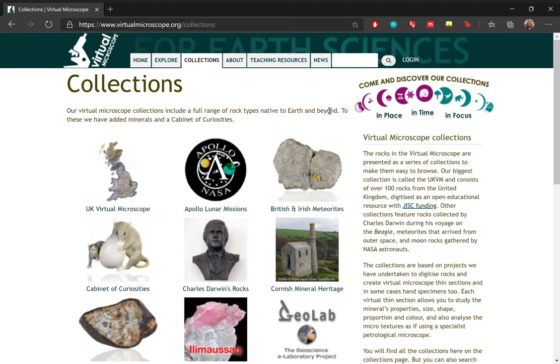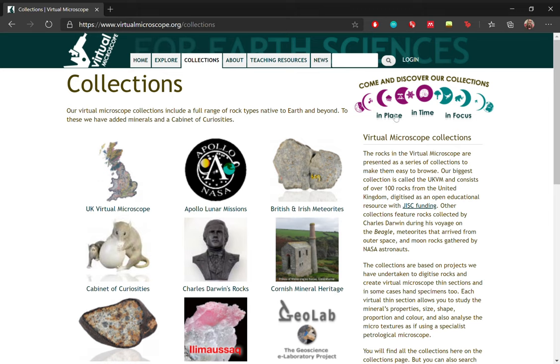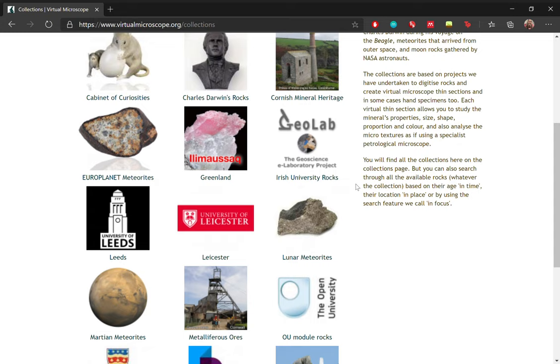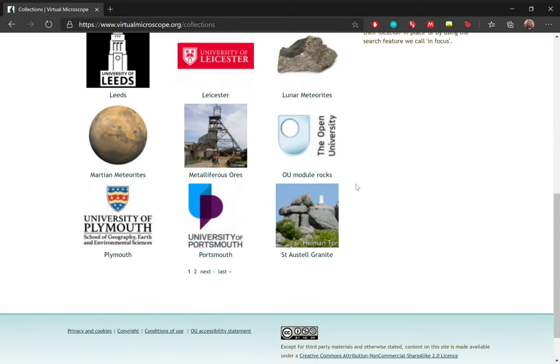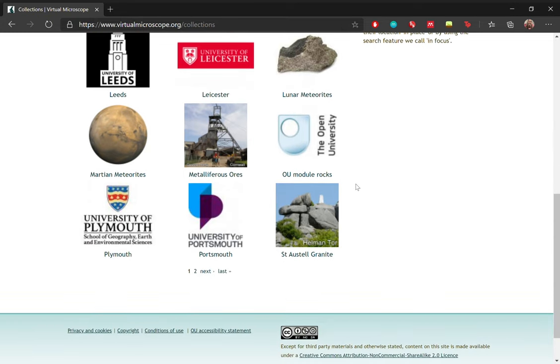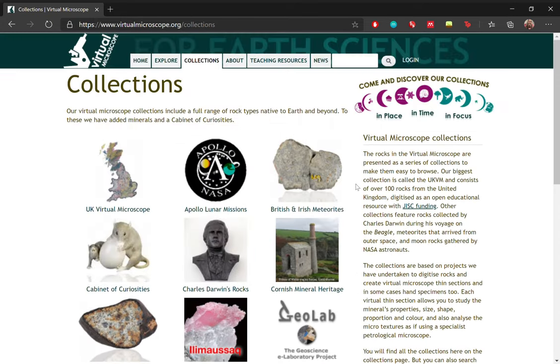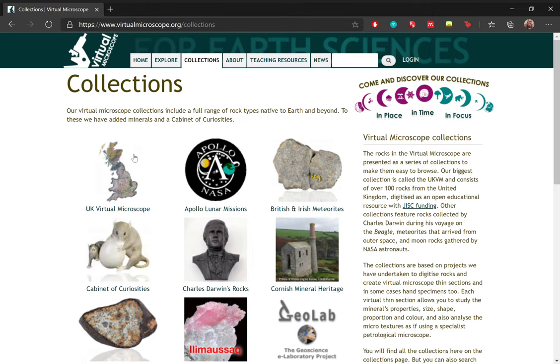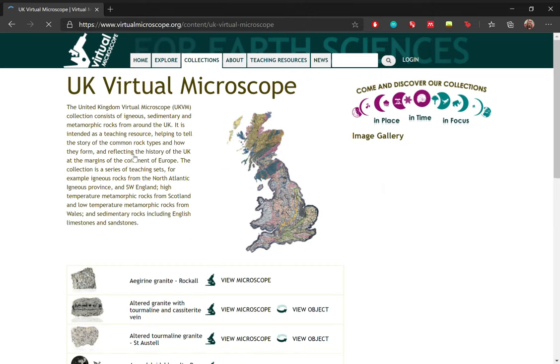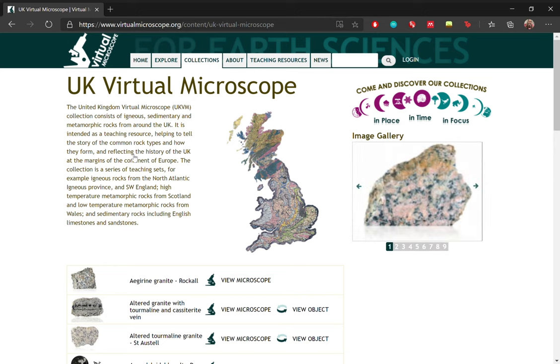So as you can see, this collection includes a full range of rock types native to earth and even beyond. So we have a collection called the UK virtual microscope, which is what we're going to look at in a bit. We also have the Apollo lunar missions, we have meteorites, we have cabinet of curiosities. There are quite a few collections here available, so feel free to explore. But we're going to start off with the UK virtual microscope.